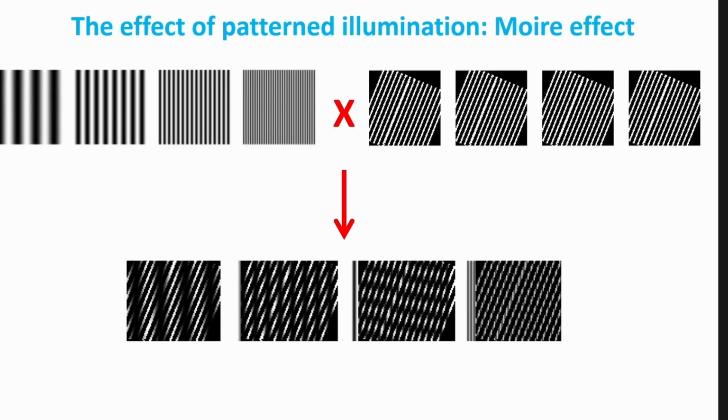This is from that, this is from that, you understand. What you see now is that from this very fine pattern, I have a much more coarse pattern because I illuminated it with one of these fields. This one is as low spatial frequency as this, so I can see it in the microscope.